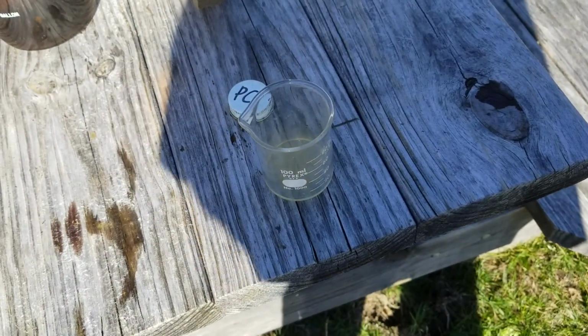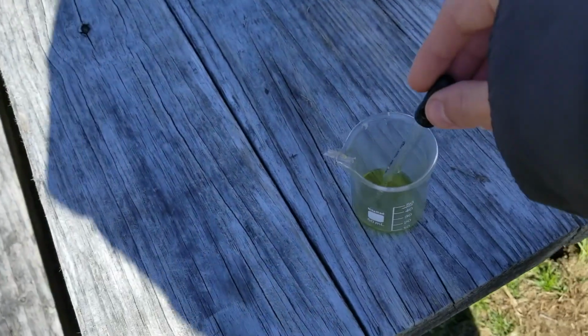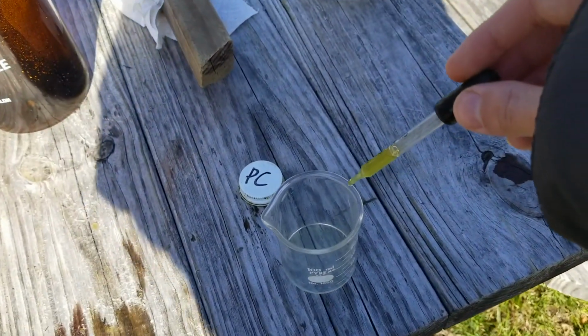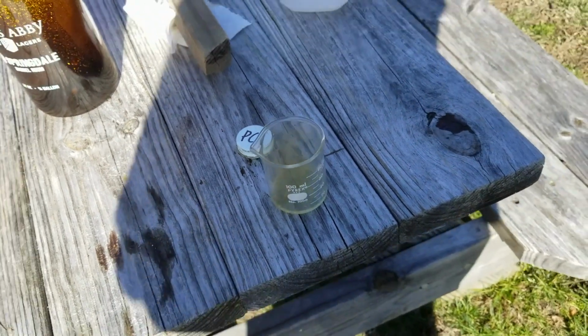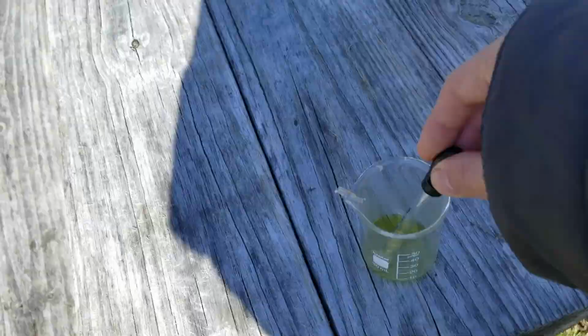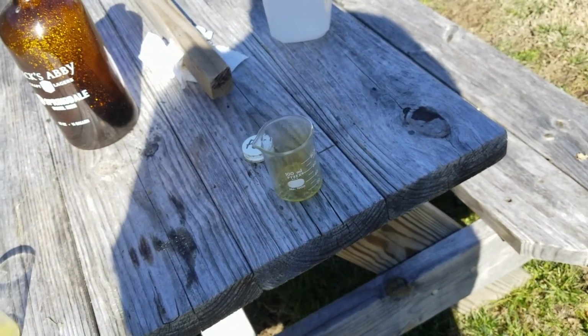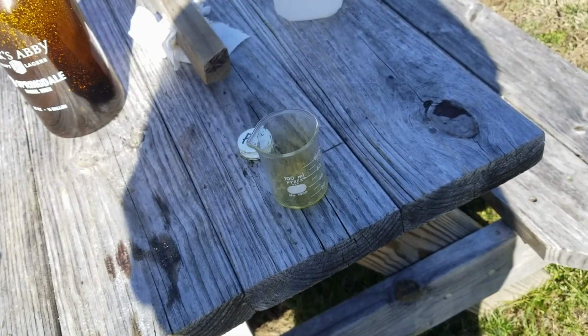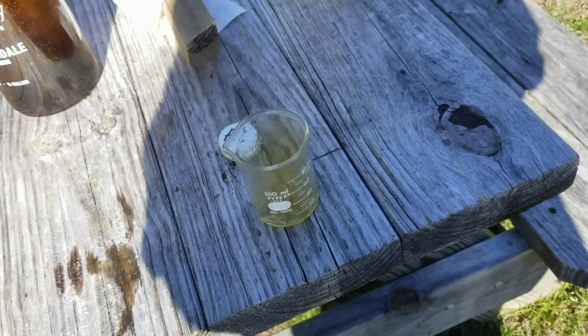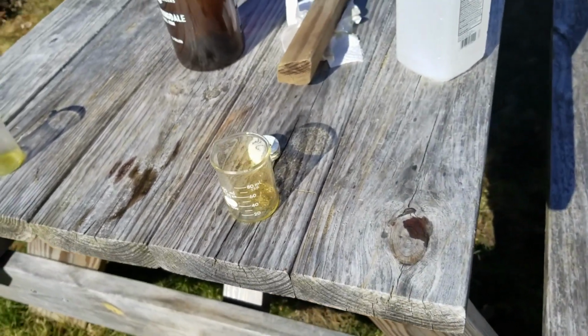Those are nitrogen dioxide fumes. That was what that red gas was. So let's get a bit more. You should definitely do this outside, by the way. This is fun. We'll be able to ignite it. It's getting pretty hot. I'm gonna stay back a bit so you don't breathe it in.